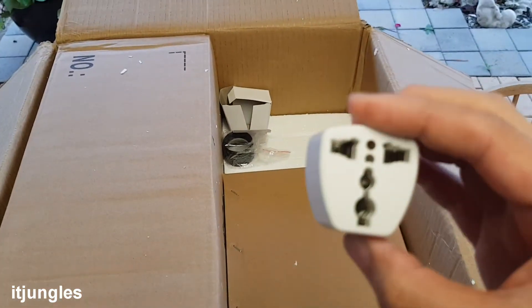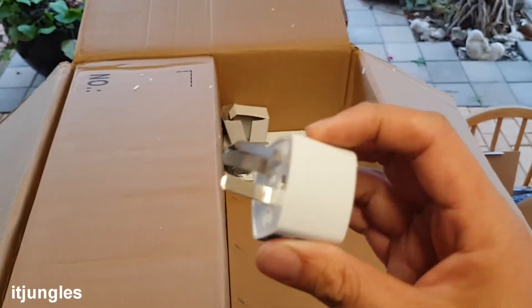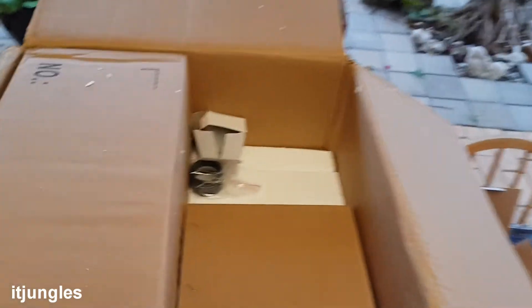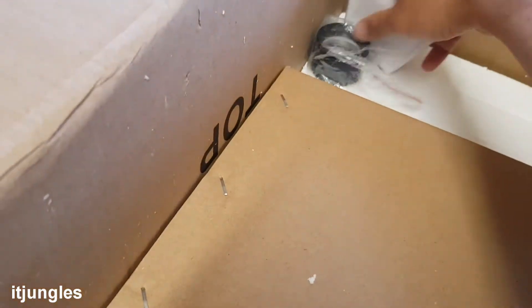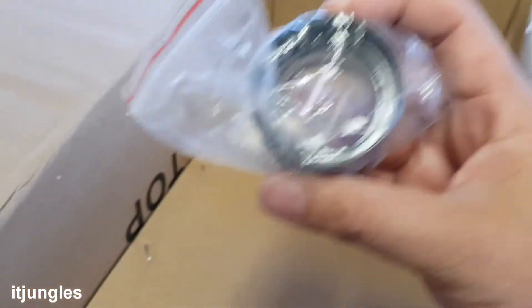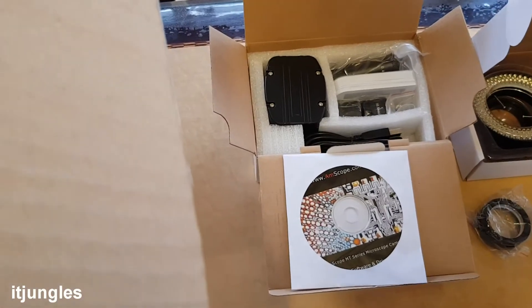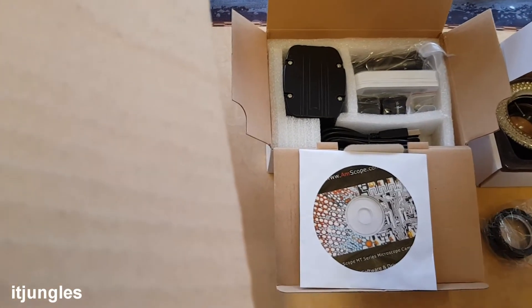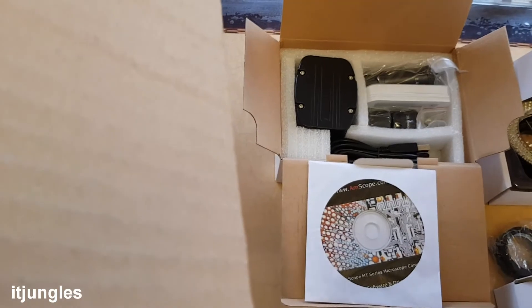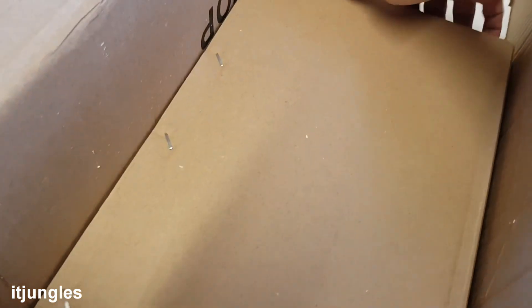They even supplied an adapter, because in my country we have a special three-pin plug. I'll put that adapter to the side. And there is another piece of glass right here, and that's another piece. I'll put this one in the right box to make sure it goes with the correct components. And there is another one right here.